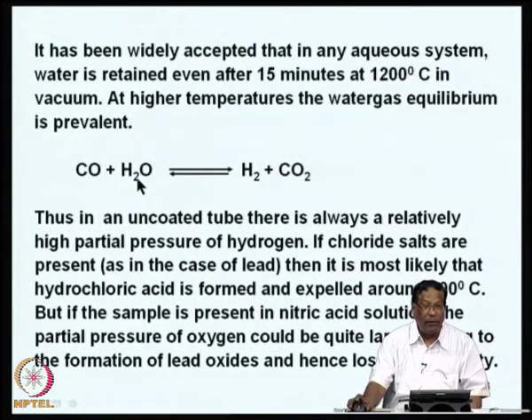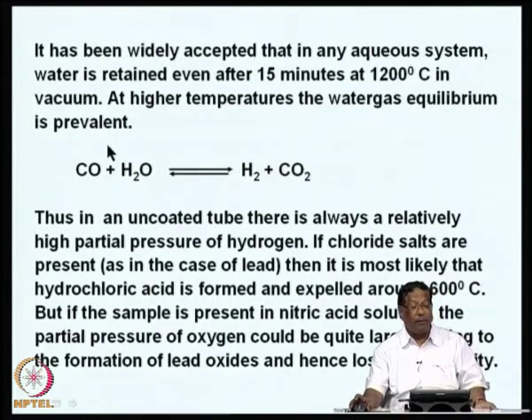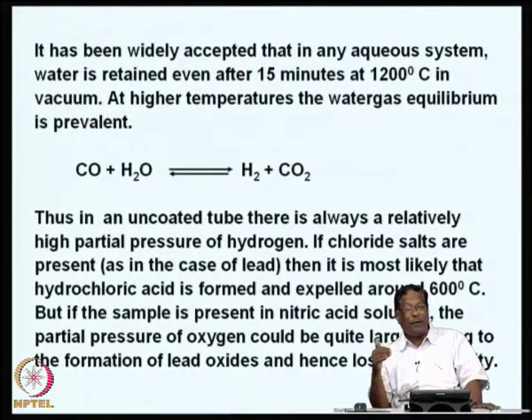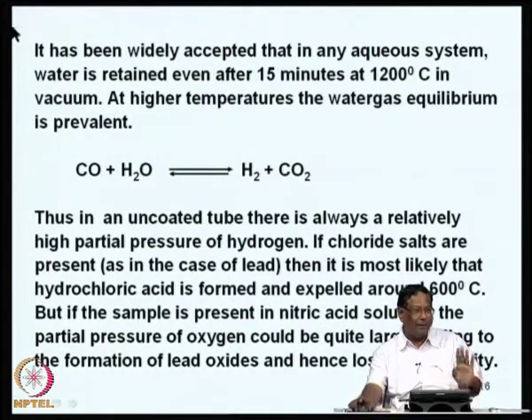So, in any aqueous medium system, water is retained even after 15 minutes at 1200 degree centigrade. We have to understand that water does not go easily compared to our understanding of 120 degree centigrade. It does not go, still it will be retained in vacuum. At higher temperature, the water gas reaction is always prevalent, that is reaction of carbon monoxide with water to produce H2 and CO2.